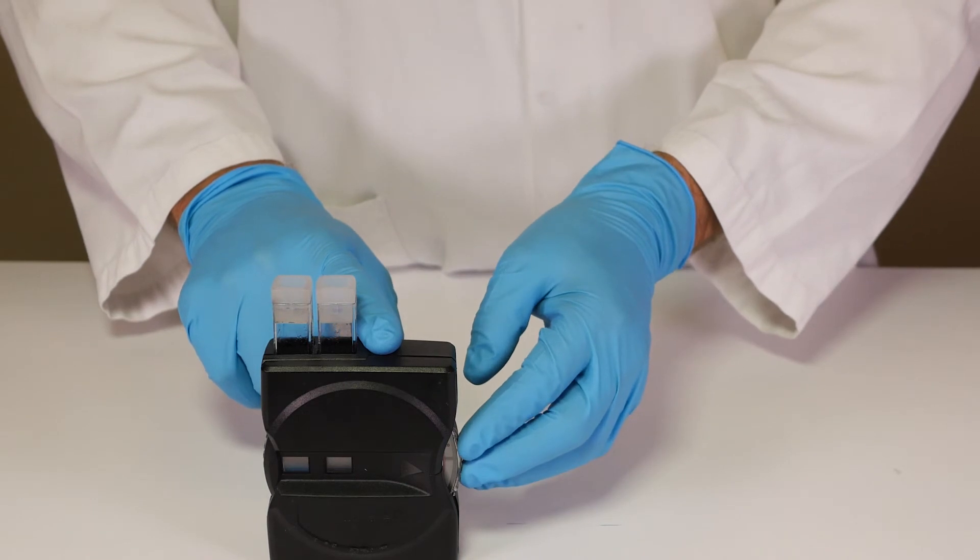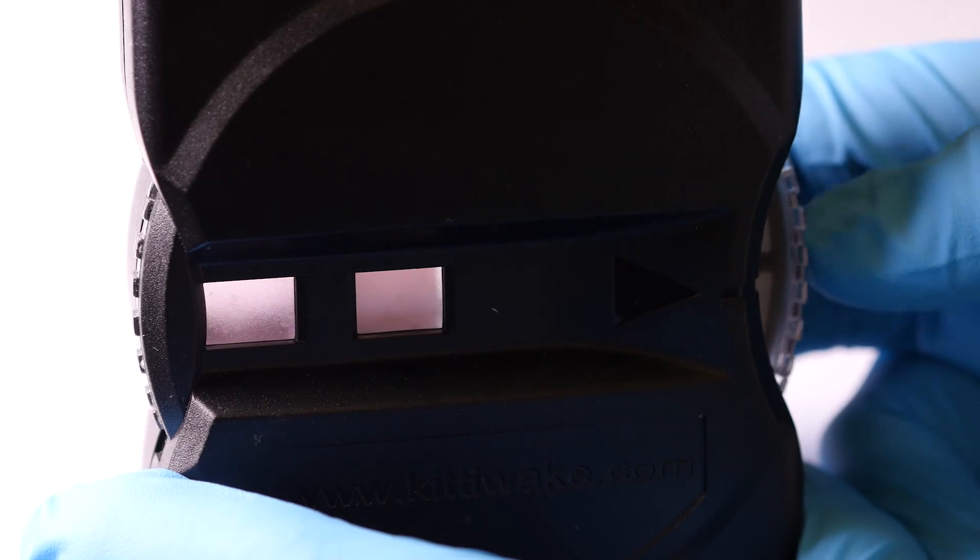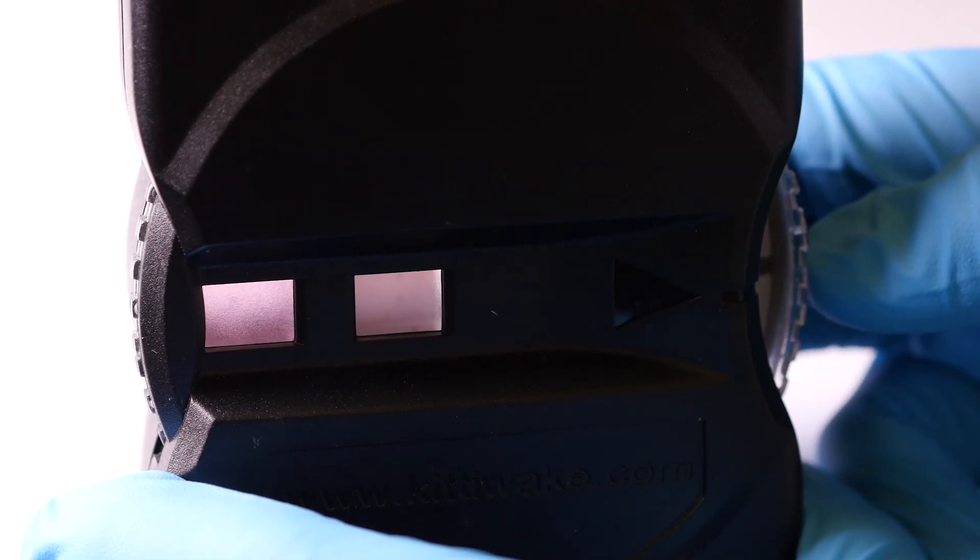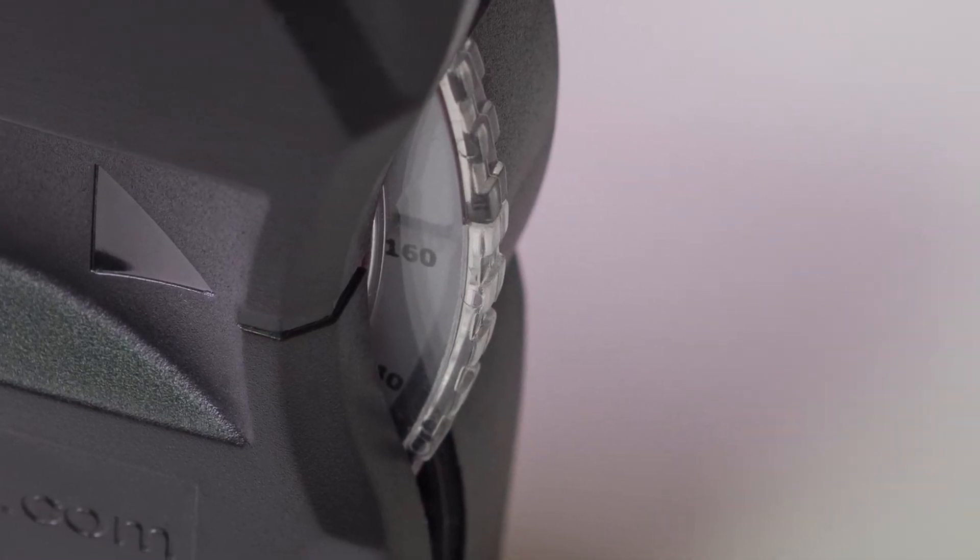Rotate the colour wheel clockwise until the colour of the outer window matches that of the inner. Read the concentration figure in ppm directly from the wheel.